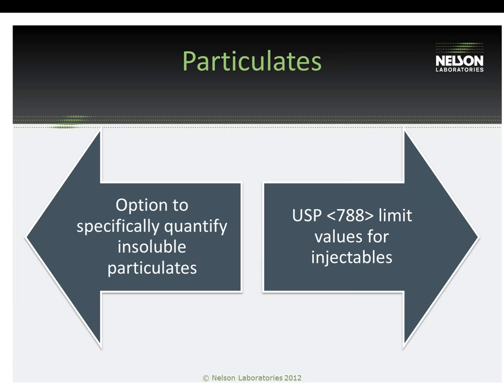You can also see with these 4 test methods that we've just discussed that there's some overlap. For example, if you have a detergent that's water soluble, the gravimetric extractable residue test, TOC, if it was comprised of carbon, as well as the detergent residual test, could quantify that detergent. And so that's why it's so important to get that list of potential contaminants, and that's how you really decide what test method is going to be best for you and your process. Everyone is going to have a unique and individual plan based on what those potential contaminants are, as well as the material compatibility of your device.